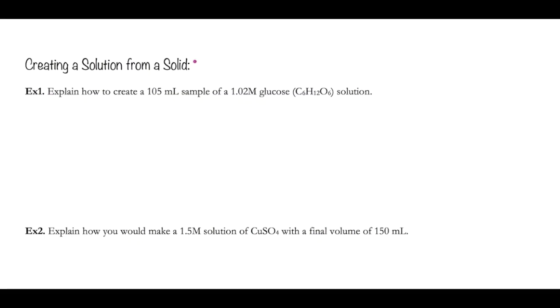So now that we've learned about molarity and concentration of solutions, in this lesson you're going to learn how to actually make those solutions. So there are two situations I could be in. In my prep room, if you go to the back of my room, there are substances, and they can either exist as solids or they can exist as solutions.